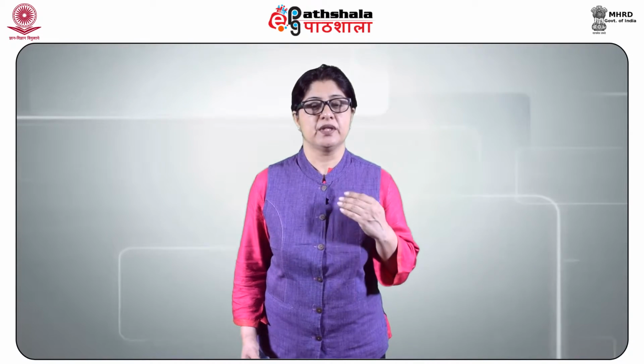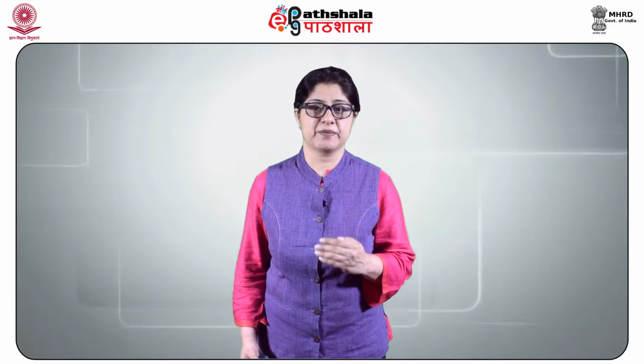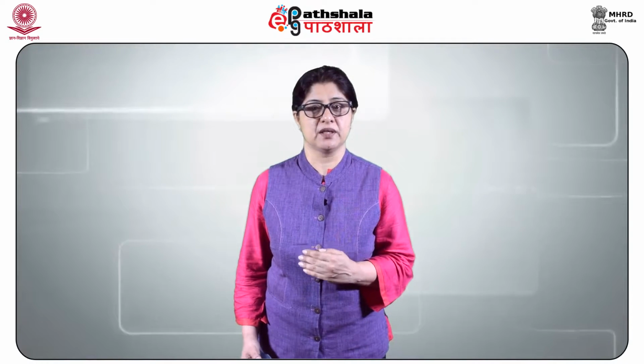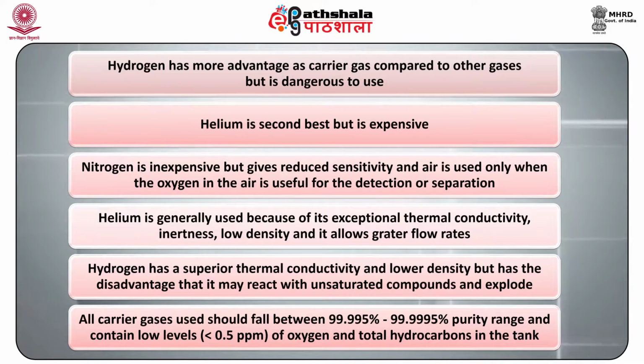The details of the various components of the gas chromatograph are: firstly, the carrier gas. The carrier gas plays a vital role and varies as per applications. Carrier gas should be dry, free of oxygen and chemically inert. The most extensively used carrier gases are hydrogen, helium, nitrogen and air. Hydrogen has more advantages as carrier gas compared to the other gases, but is dangerous to use. Helium is second best but is expensive. Nitrogen is inexpensive but gives reduced sensitivity, and air is used only when the oxygen in the air is useful for the detection or separation.